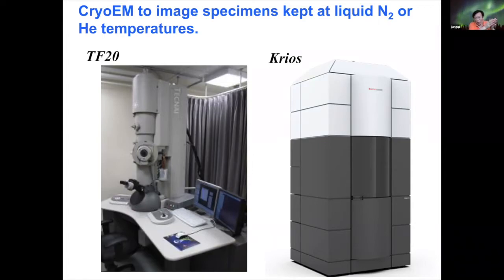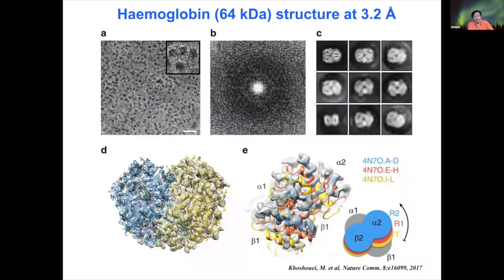The modern microscope is much more stable and has a lot of other advantages, such as optical properties, so that data collection is automatic, much faster, and can continue for an extended period of time. This makes it easier to collect enough data to deliver an atomic resolution structure.